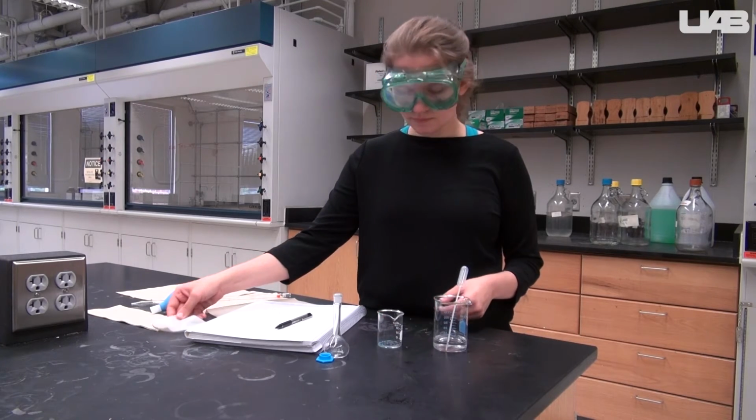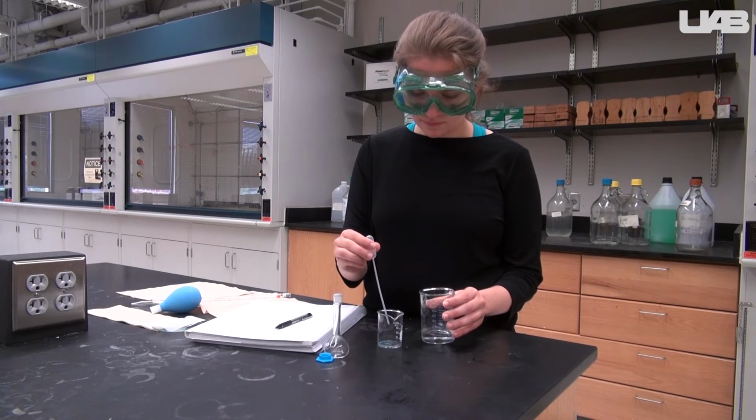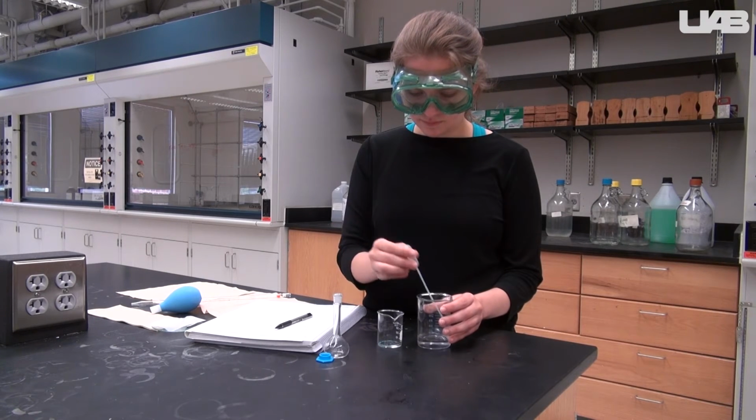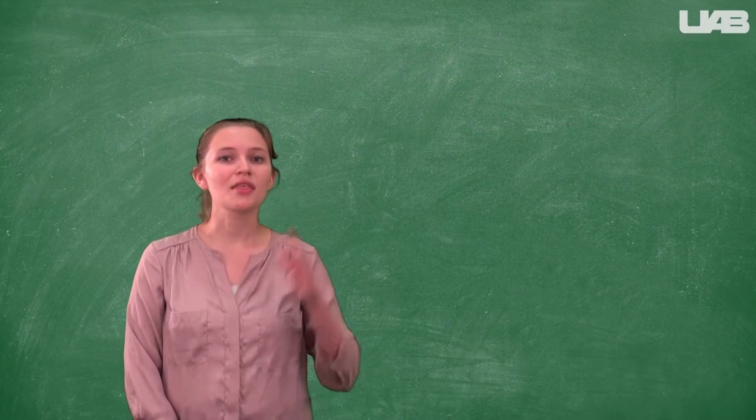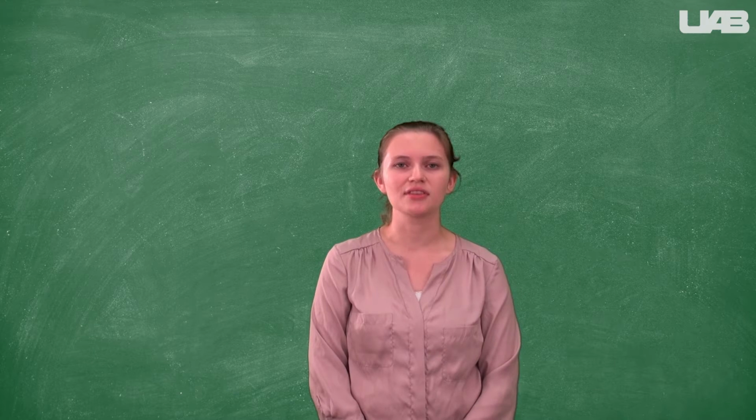Next, dissolve the copper sulfate into a small volume of water. You can stir it and warm it with your hand to help it dissolve. Once it dissolves completely, you will have formed this complex ion. Now it is time to move to the hood to add the ammonia.